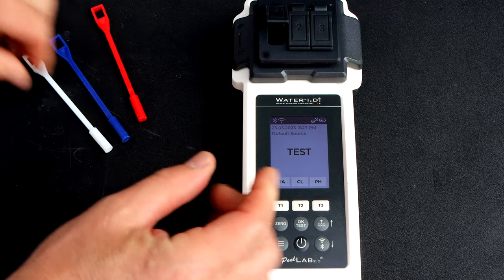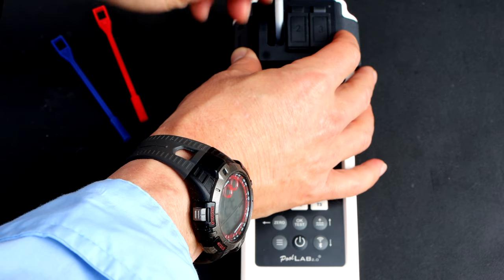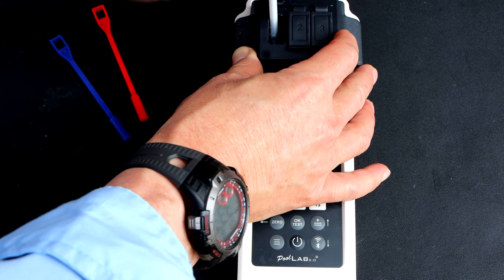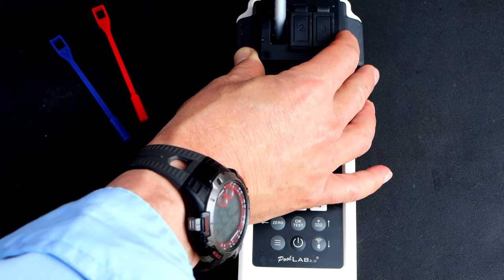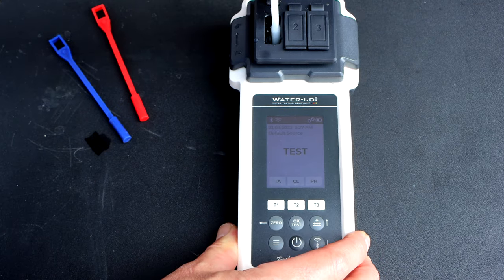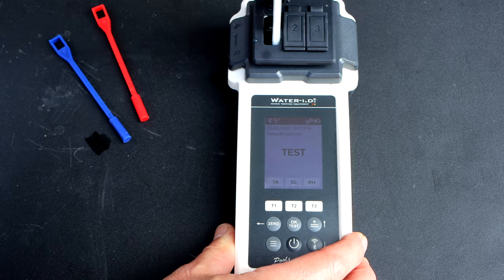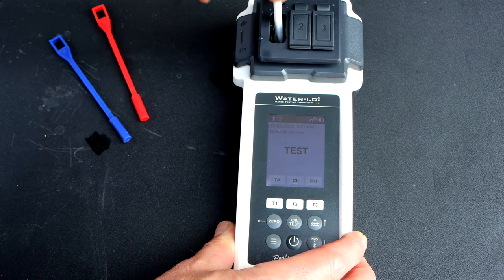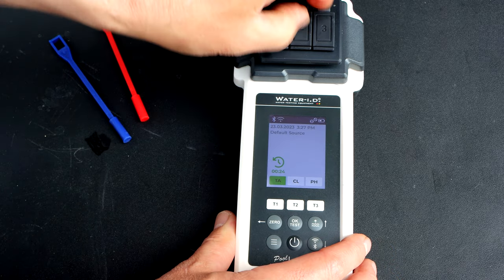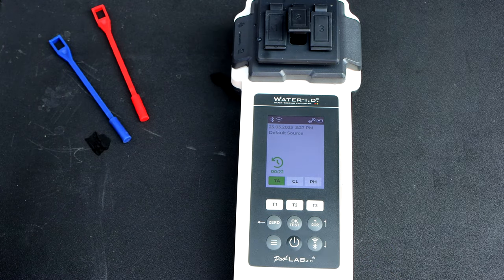There are three stirrers or crushers, all different colors, so that you can do all three test factors without cross contamination. I really like how deep these chambers are. You can really work at it and crush the tablet rapidly without really worrying about too much water splashing, especially with the rubber guard. I can really crush these tablets really fast.